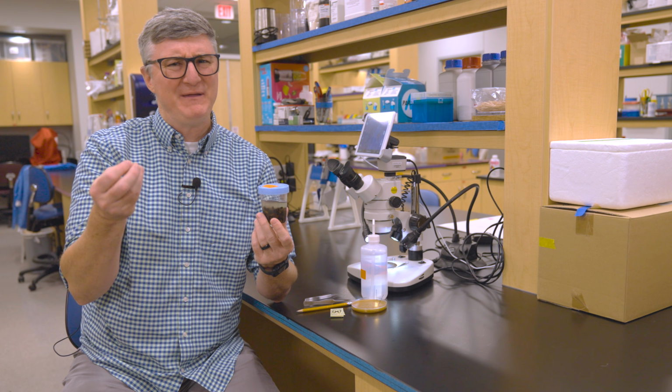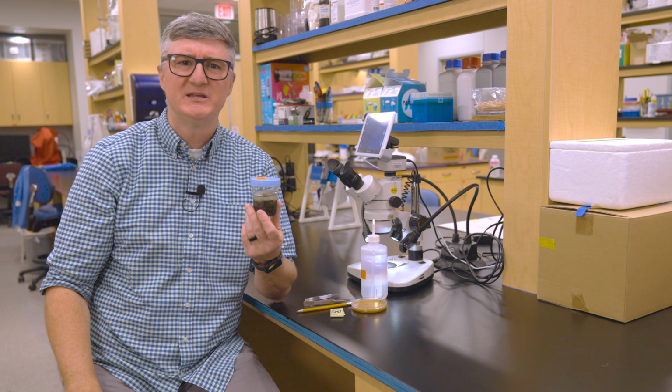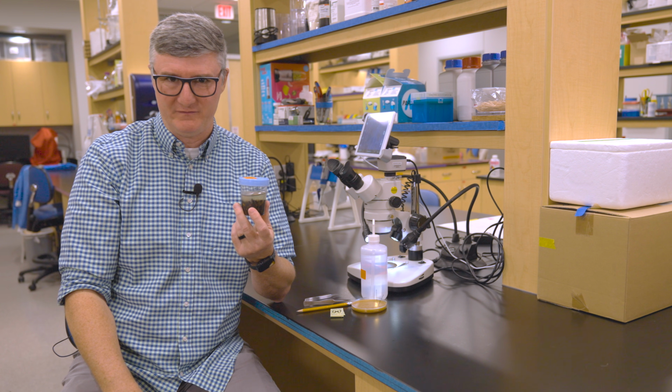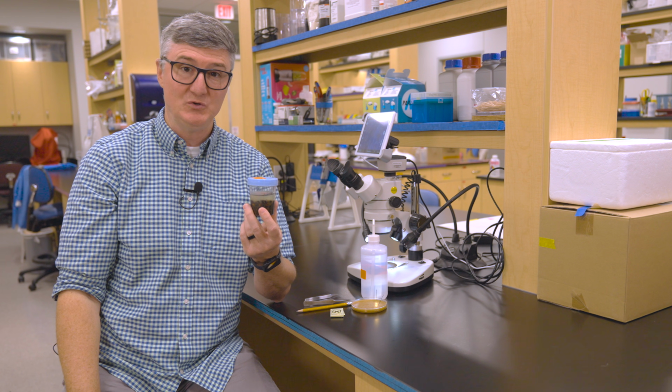But secondly, having bees in water means that when you're working with those bees during the dissection process, you'll have a lot of bubbles forming around the bees, and it makes it very difficult to visualize. So alcohol is just the substrate you want to use.